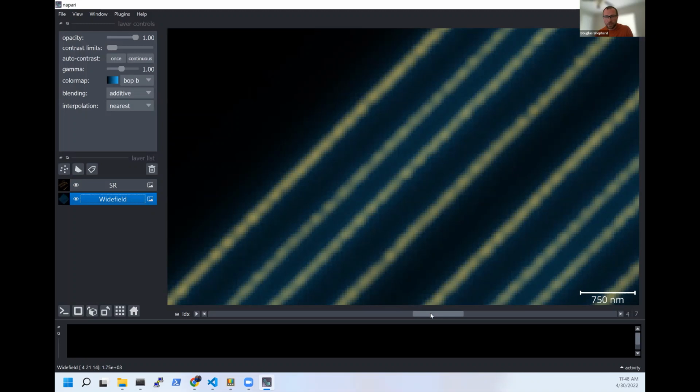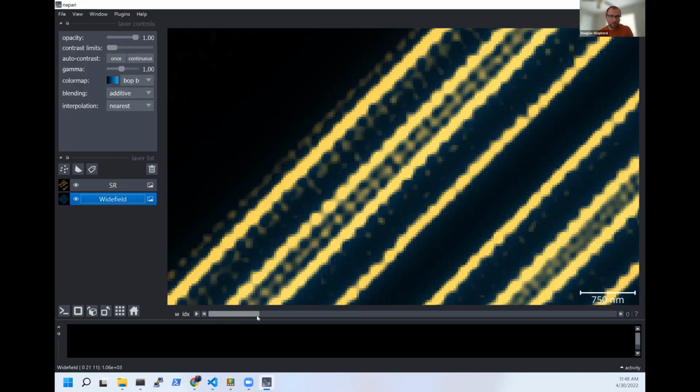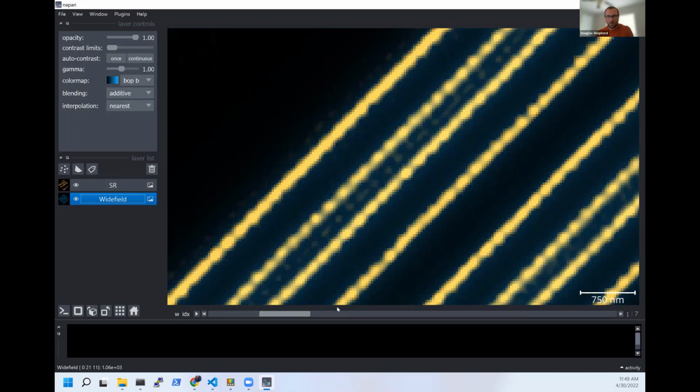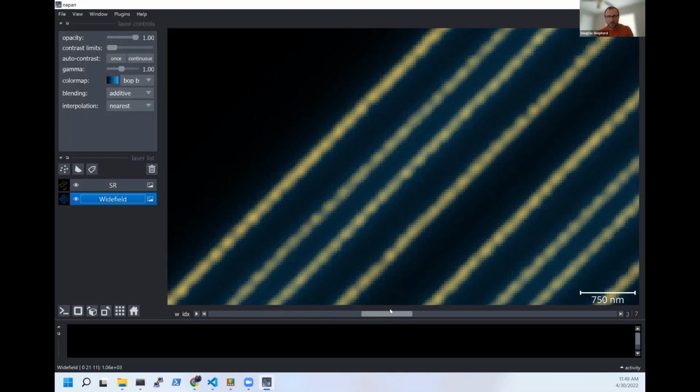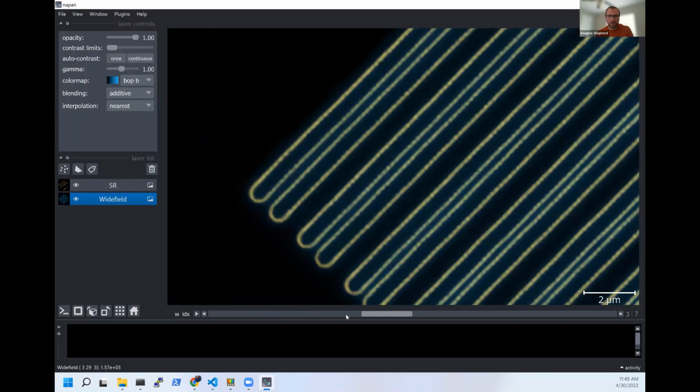So now what I want to do is slide the Wiener parameter. Here is where the Wiener parameter is the smallest, which, remember again, is 0.05. And now you can see as I start to slide over, what starts to happen is the images both get dimmer and we start to lose that high frequency noise. And so it can be useful to look at the edges of these resolution targets.